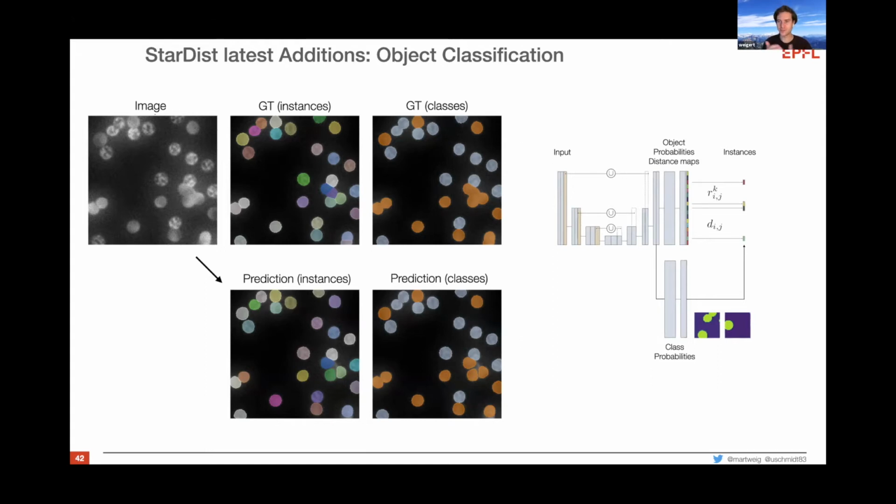This is still a little bit, I mean, we haven't really tied that up in a super easy to use interface, but if you're interested and want to hack a little bit, you can use this prediction, because it is essentially a foreground-background prediction per class. You could just merge that and use it to expand the original StarDist markers according to this class in your watershed, for instance. That's probably very simple to do if you really want to have that outline pushed to the border precisely.